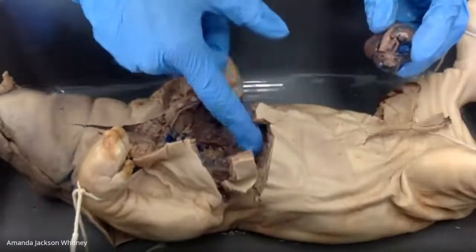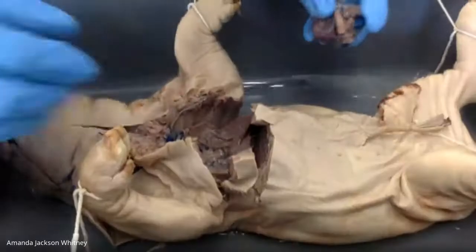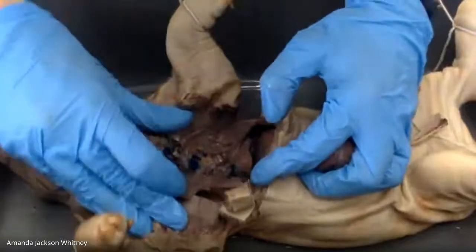I could be wrong, but is it the diaphragm? Ooh, good guess. The diaphragm is the muscle down here. Is it the pulmonary valves and arteries and stuff? Yes, exactly. The pulmonary arteries and pulmonary veins.